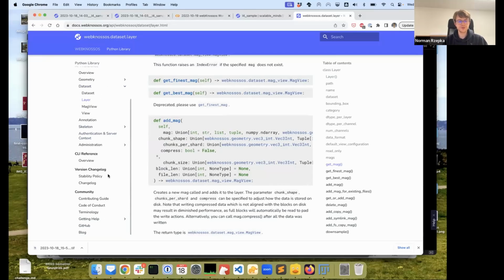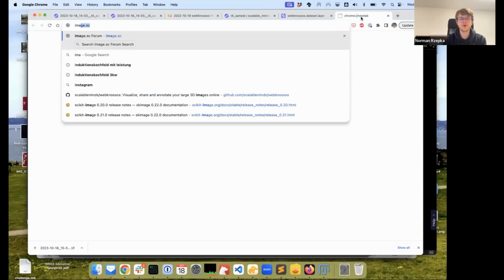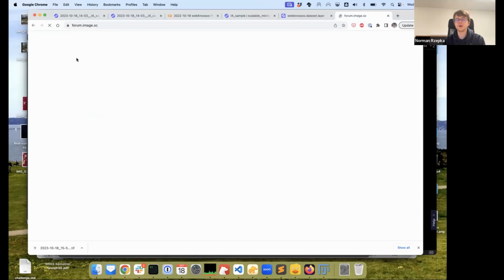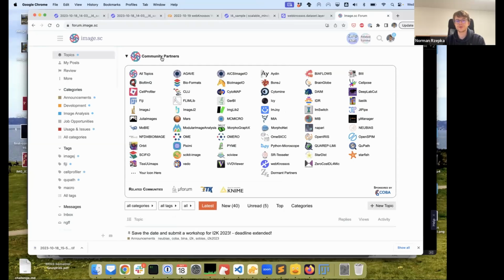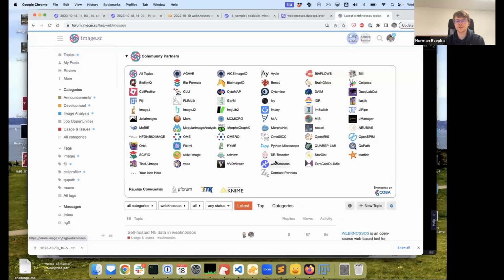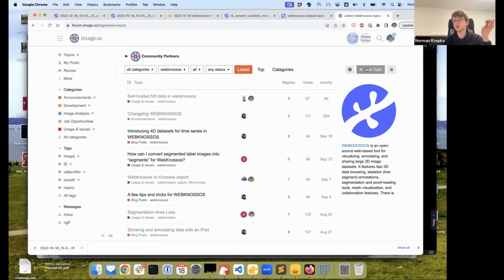Maybe that's a good thing to mention. I'm sure most of you know about the image.sc forum. Webknossos is also present there. So if you go to community partners and click on Webknossos, then you can ask any question here, open a new topic, and then we'll be happy to help, or somebody else from the community will also be happy to help.